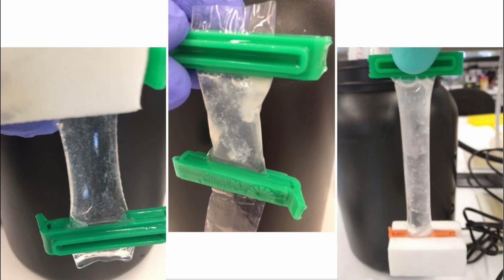When no information is available about the compatible buffer, it's necessary to carry out a macrodialysis analysis with several buffers to look for the best one. The macrodialysis technique will be explained in more detail in the protein characterization section.